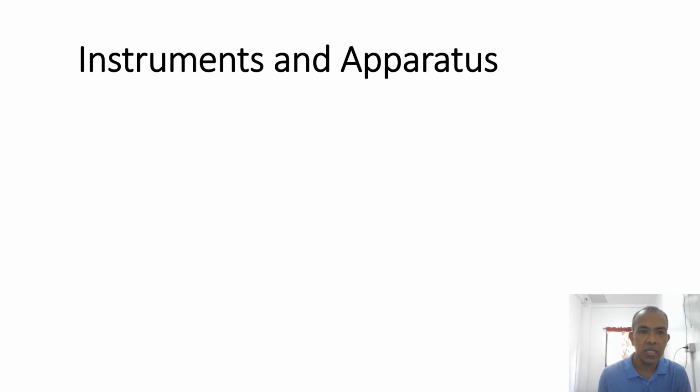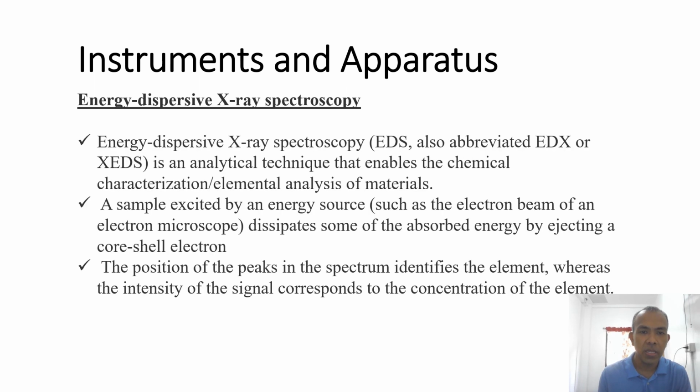So next slide. I will introduce the main instrument that I used in this experiment, the Energy Dispersive X-ray Spectroscopy or EDS. EDX, also abbreviated as EDX or XEDS, is an analytical technique that enables the chemical characterization or elemental analysis of materials.